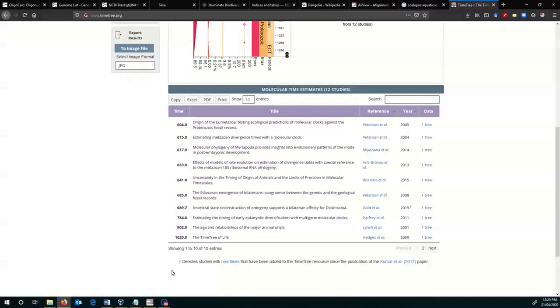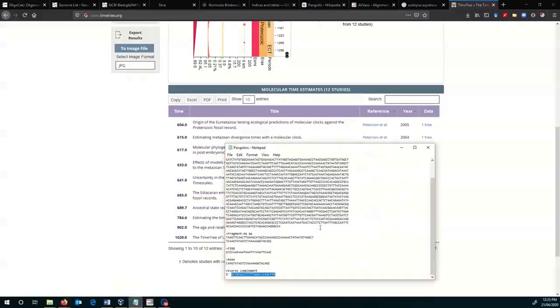So I would really imagine that pangolin primer set would work actually. So if I was going to work on pangolins, I would just order that now, and I'd be 95% sure we'd get some useful results out of that. But you still have to test it. If I was doing that project, I might have a go at designing one or two more. I might look at some other mitochondrial regions and see if I could work with those as well. But in this case, I'm just showing you as a demonstration.